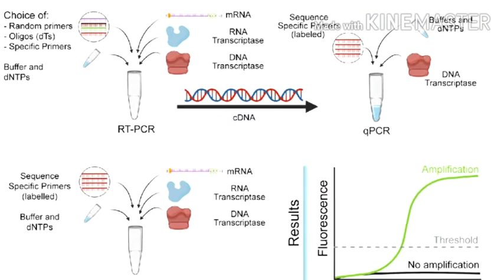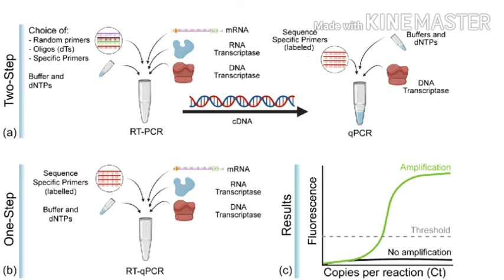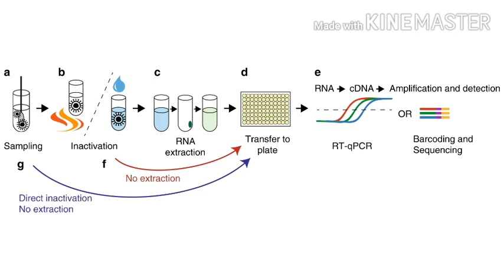Carrying out RT-PCR on an organism under different growth conditions reveals when the gene under scrutiny was switched on. This allows analysis of which environmental factors bring about expression of any chosen gene.